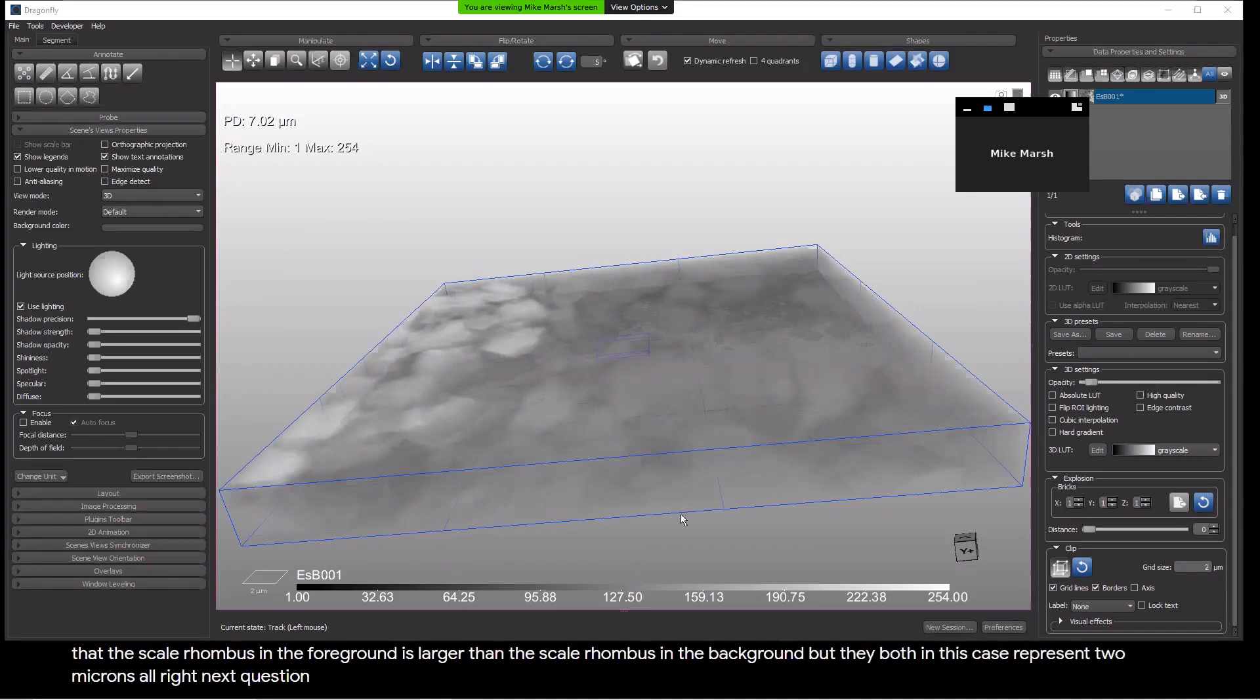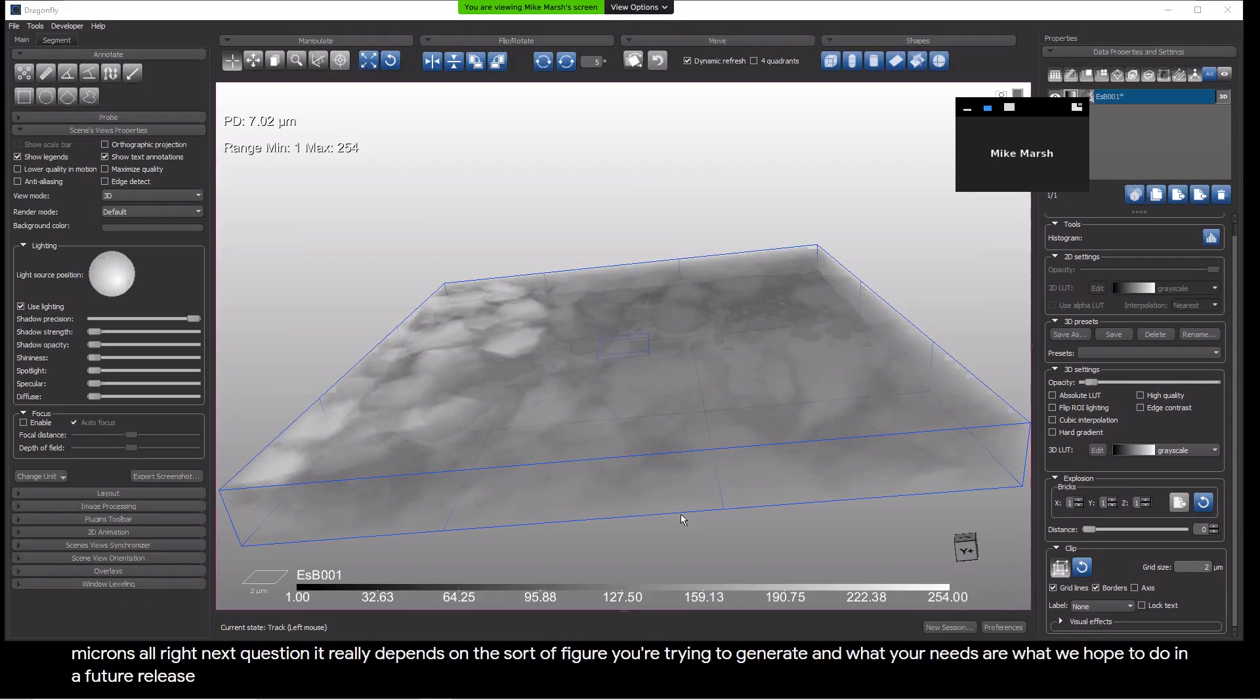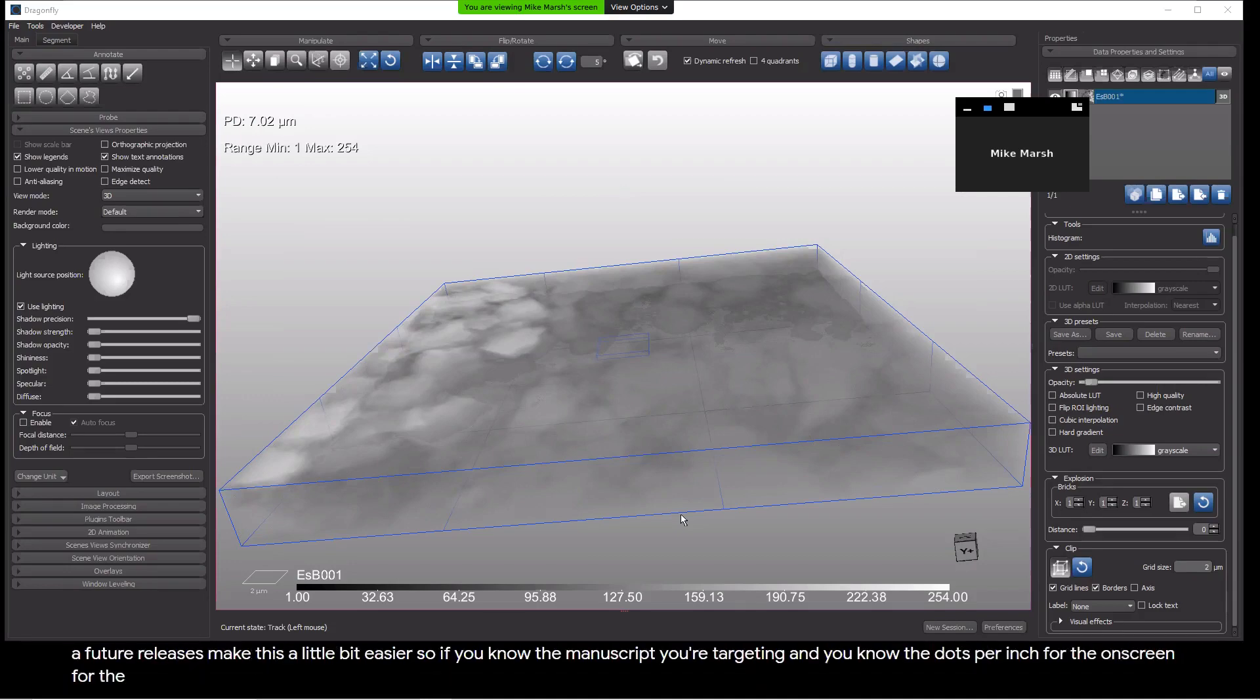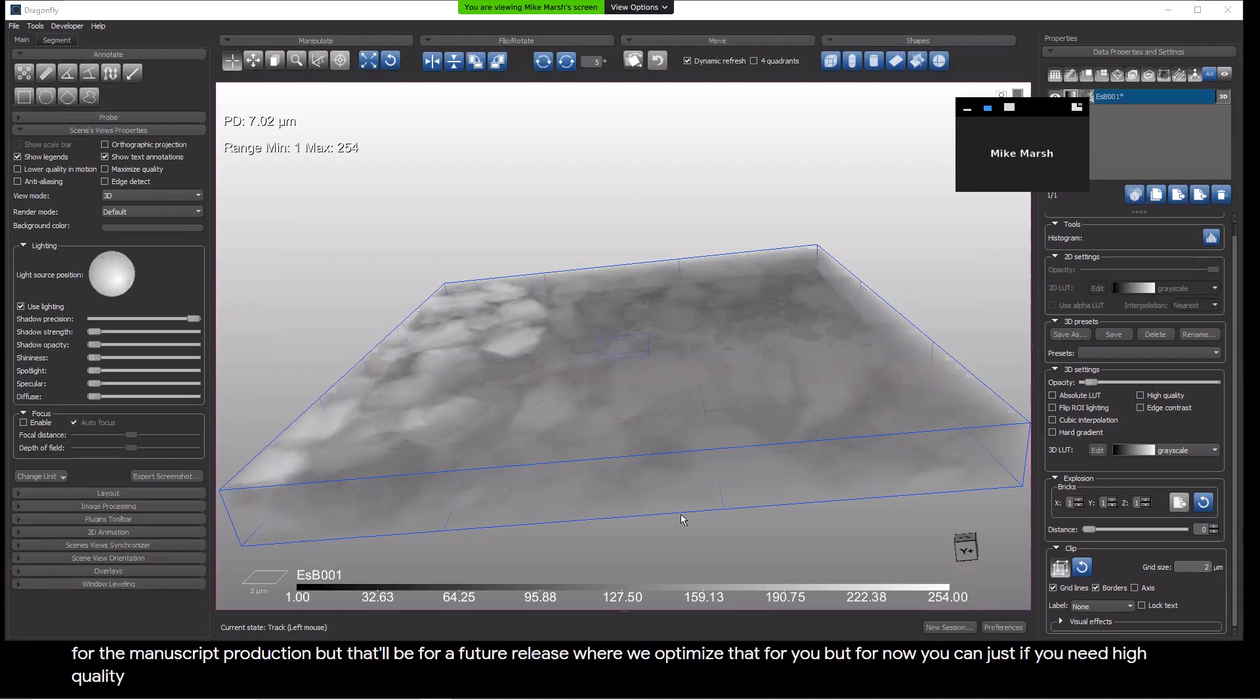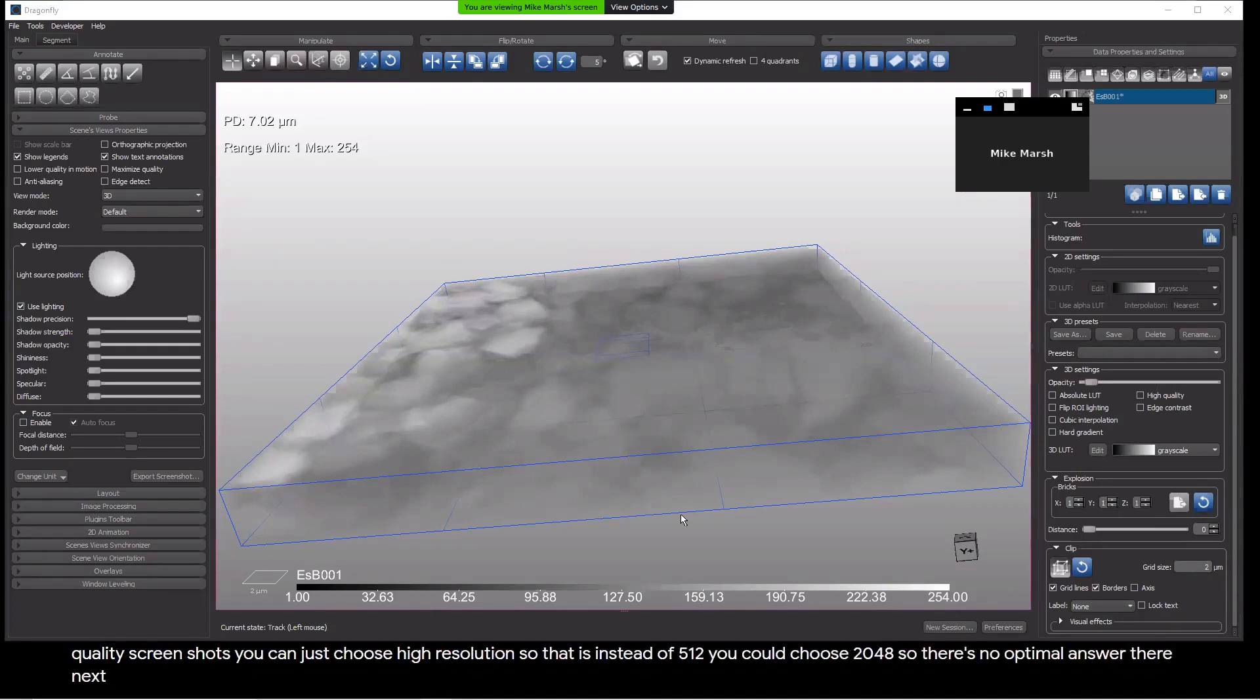Next question. What is the best choice of screenshot resolution? Well, that really depends on the sort of figure you're trying to generate and what your needs are. What we hope to do in a future release is make this a little bit easier. But for now, you can just, if you need high quality screenshots, you can just choose high resolution. So that is instead of 512, you could choose 2048. So there's no optimal answer there.